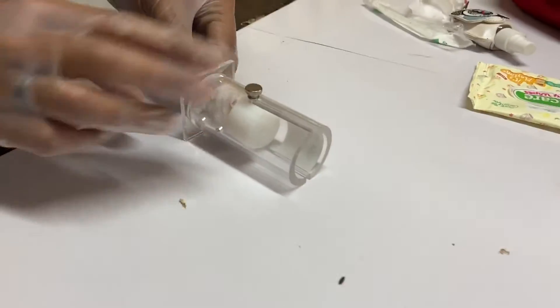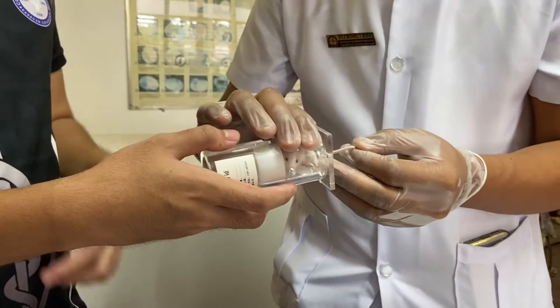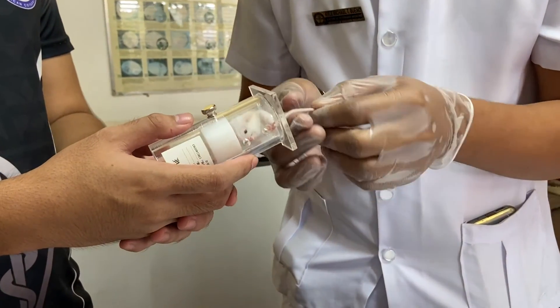The animal is now ready for further manipulations — in this example, blood collection.